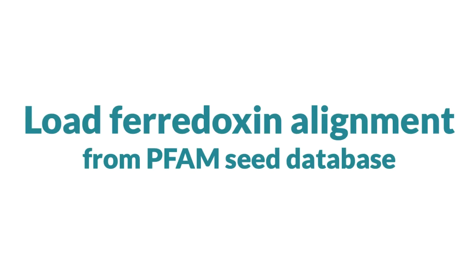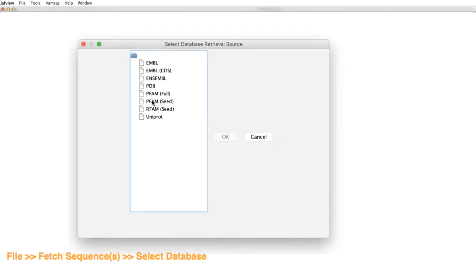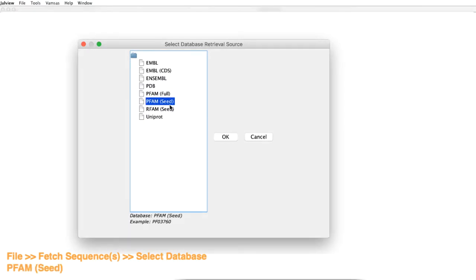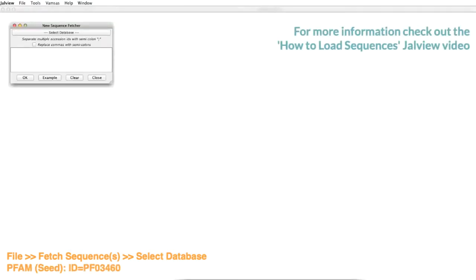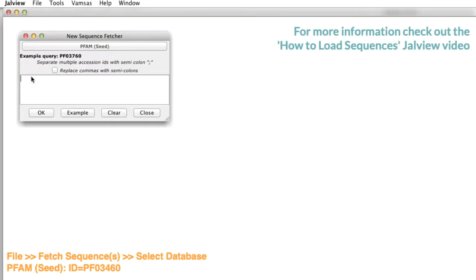I have already opened Jalview. Now I shall load a ferrodoxin sequence alignment from the PFAM seed database using the PFAM ID PF03460.